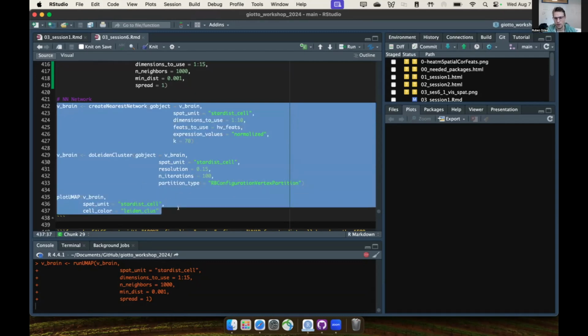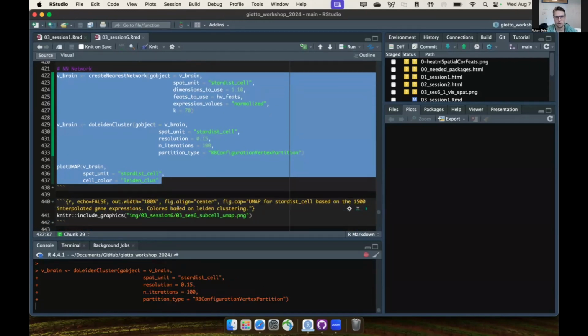In that link, you can see what other types of spatial data analysis, much more complex than what we're showing today, are possible on, for example, species analysis and that sort of thing. And all of that can be applied on spatial omics, right? The data itself is very similar to any type of geology data or species data or whatever other modeling you're trying to do.